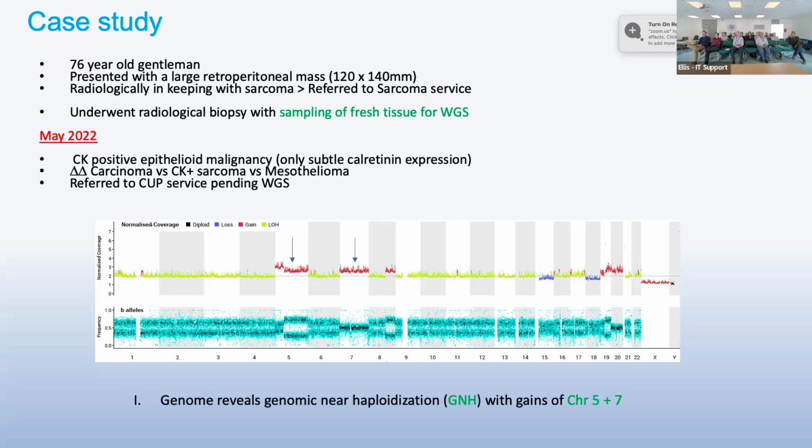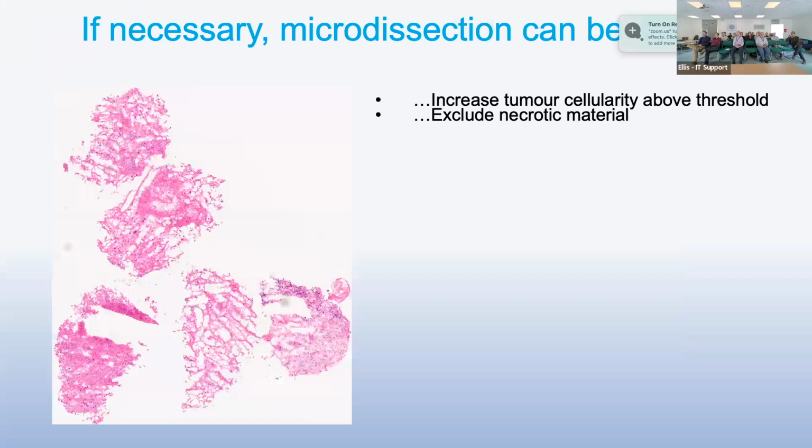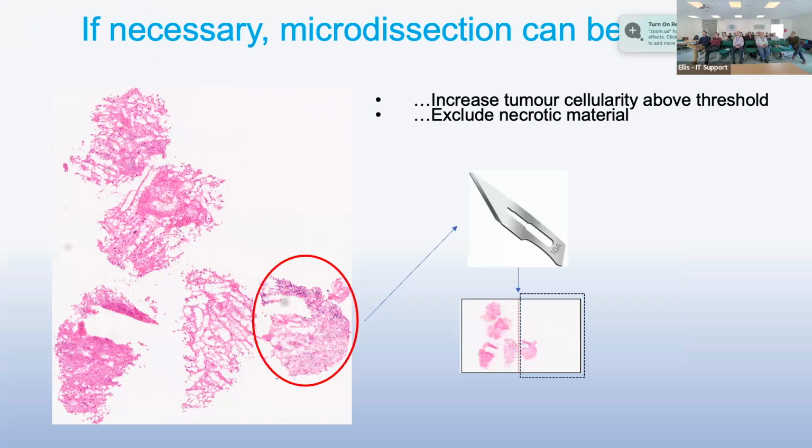Oh, sorry, this is a bit of a, I don't know what this is doing here. This just shows that sometimes we have to dissect the block to get the tissue.